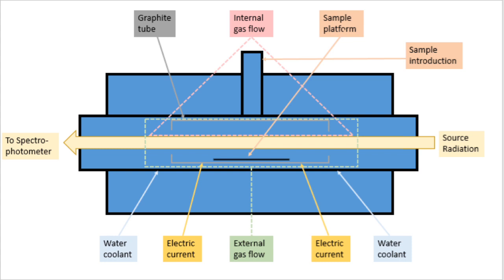However, electrothermal atomizers have disadvantages, including slow measurement time because of the heating and cooling required of the system and a limited analytical range. Additionally, analyte and matrix diffuse into the graphite tube, and over time, the tube needs replacing, increasing maintenance and cost associated with electrothermal atomization.